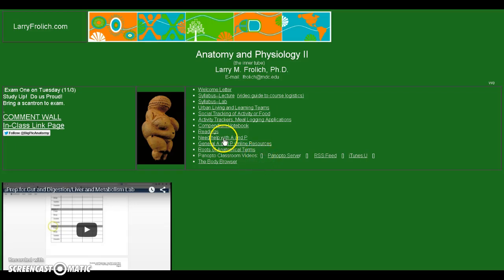All right, anatomy and physiology students. This video is going to take us through the histology slides for the gut and digestive organs.